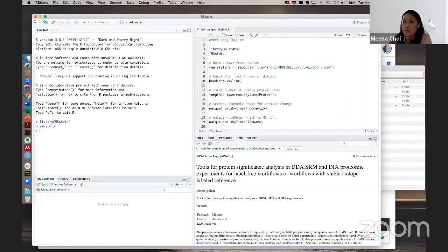I will answer some questions. For TMT, the isobaric labeling strategy, we have MSstatsTMT, which we will cover tomorrow. The question is whether SILAC is supported. If you use SILAC, it's general SILAC, which means if you have one run or one group completely as control, like SRM with the heavy labeled peptide, that works. If you mean two groups with two different labelings that you want to compare, generally we cannot cover it. So if you really want to use this, we have to do more customized data manipulation before that.